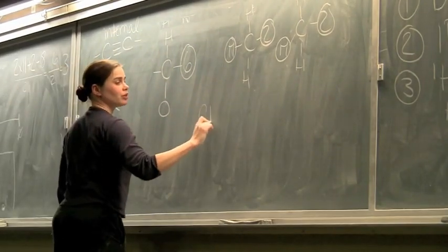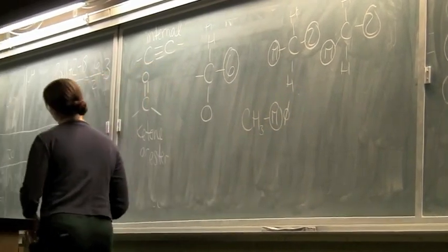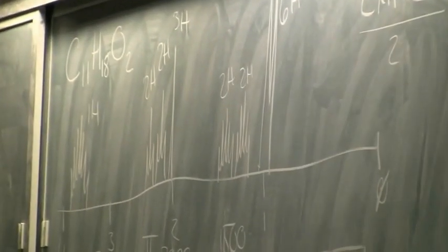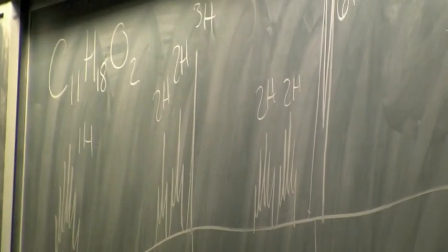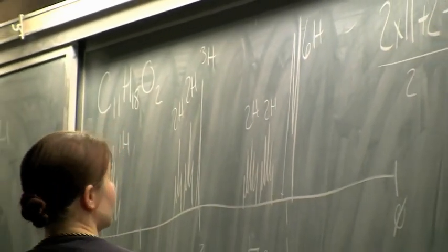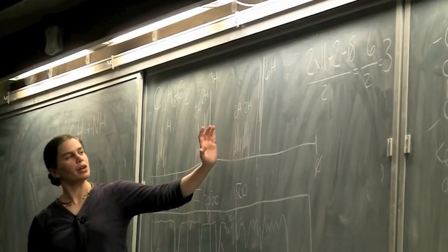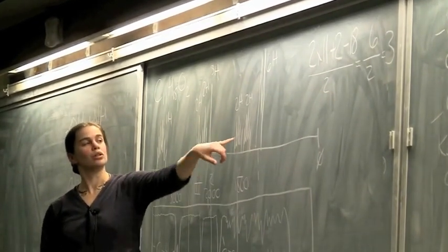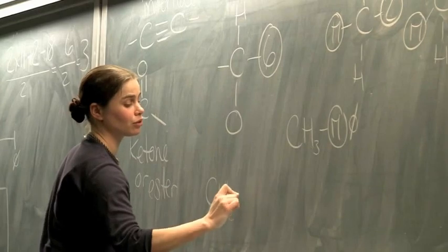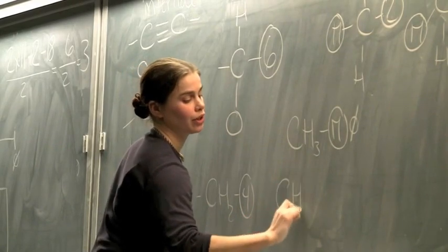Also in that region, CH3, pi bond, 0 neighbors. It's a singlet. No neighbors on that CH3 means whatever that neighbor is doesn't have a CH attached to it. So lack of coupling is actually information, since we have no neighbors. So those are our alpha to something interesting, somebody next to pi bonds. We keep going. We've got two CH2 pentets, things that have 5 peaks. They're slightly different. They're not symmetrical. CH2 next to 4, and CH2 next to 4.